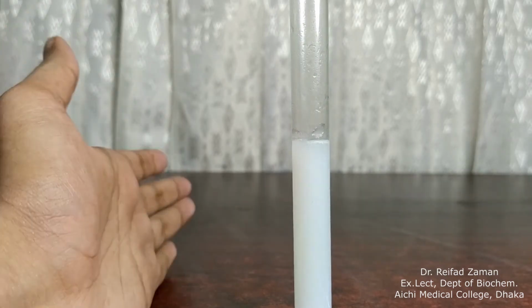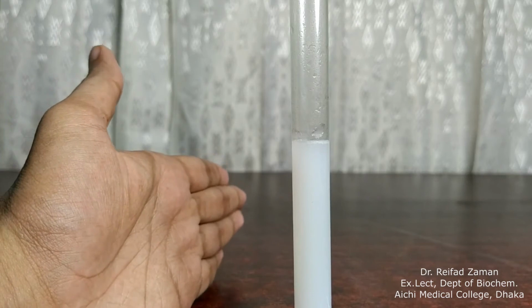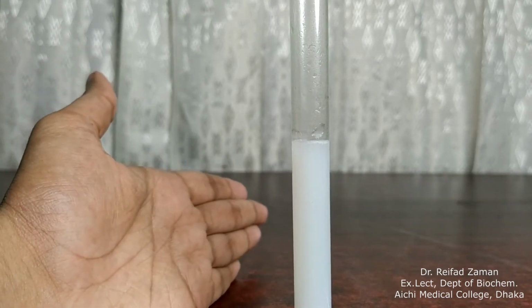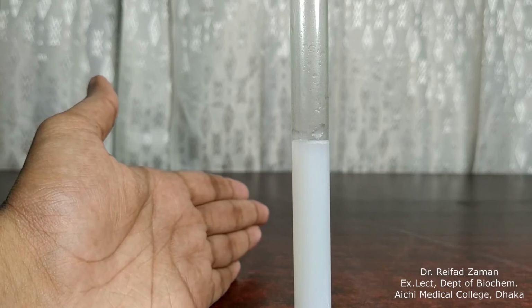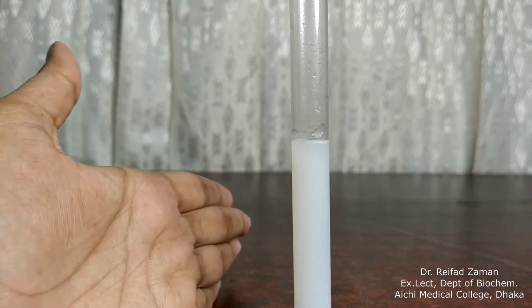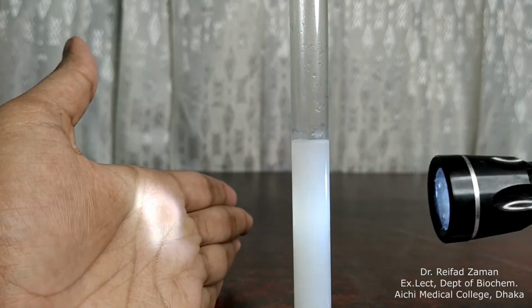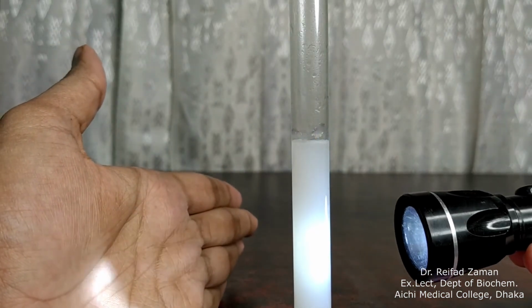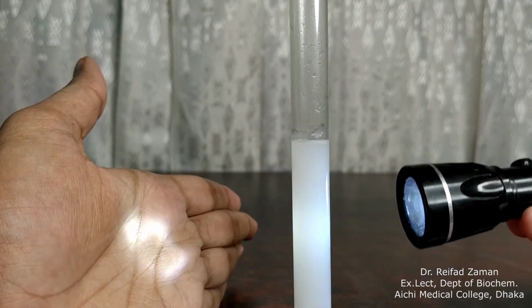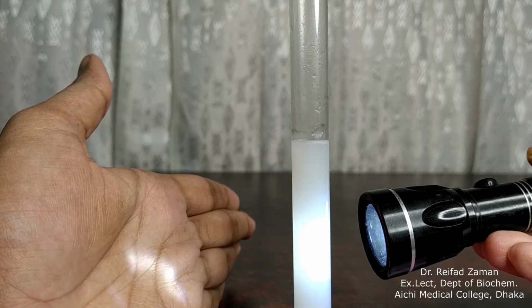And the last interesting factor is the Tyndall effect. Last time আমরা দেখছিলাম যে যখন আমরা একটা crystalloid solution ইউজ করছি বা একটা ইউনিফর্ম মিক্সচার আমরা করলাম, তখন we saw যে লাইট পাস করলে সলিউশনের ভিতর দিয়ে গিয়ে অপোজিটে পড়ে and কোনো রিফ্লেকশন হয় না। But this time it's different. As you can see, এইটা নর্মালি লেজার লাইট দিয়ে করার কথা, but I'm using a normal light and still you can see the effect.